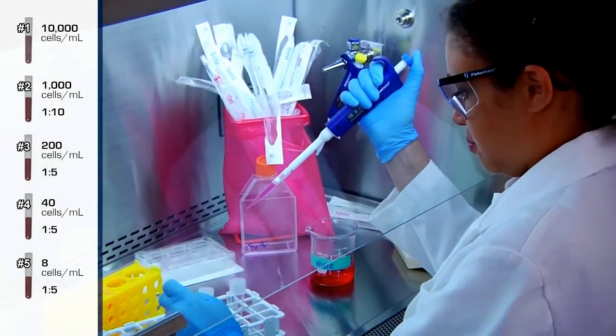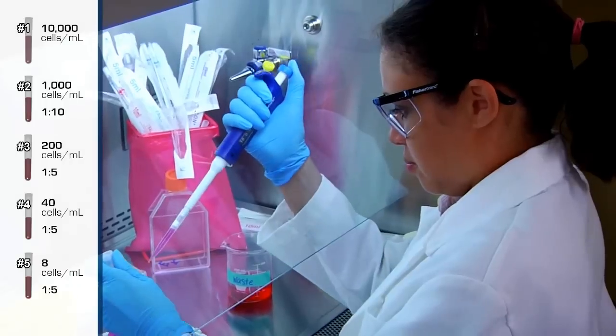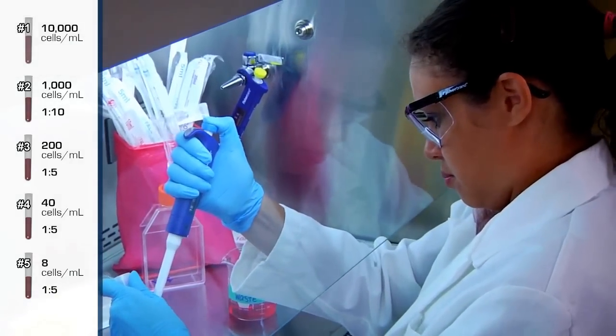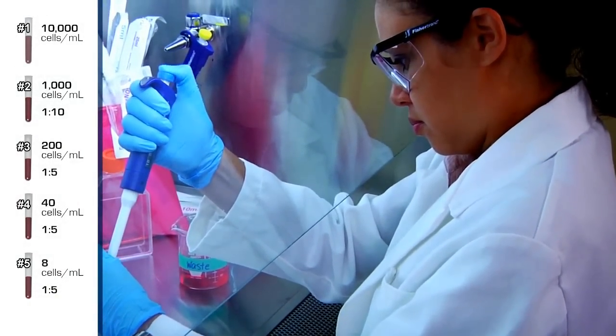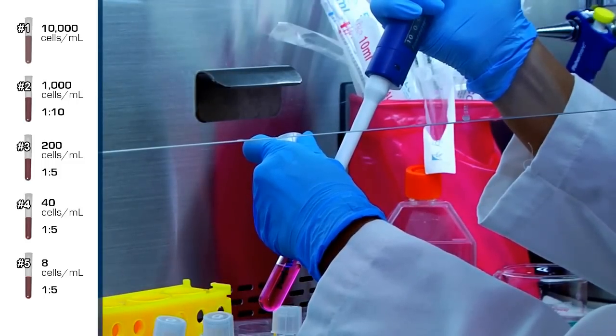Transfer 1 milliliter from tube number 3 to tube number 4 for a 1 to 5 dilution. The concentration of tube number 4 is now 40 cells per milliliter.